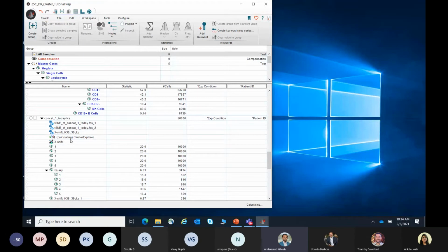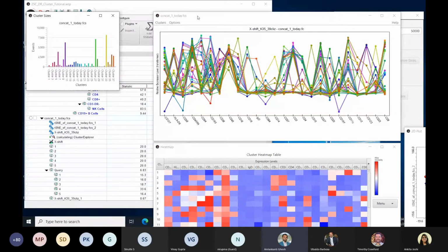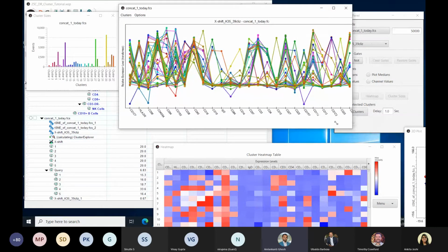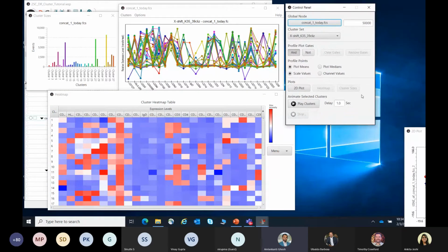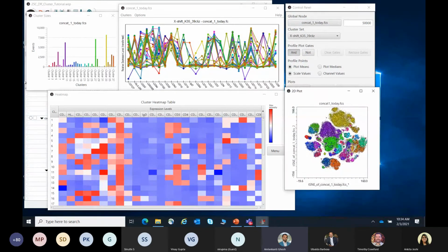Yes, there we are. Maybe the visuals are bad, it's taking time. Okay, it has come. What I can see here is I'll try to reduce it in order for you to see, and squeeze everything into the small space that I have. And this is the heat map. This is a control panel that also comes along. You can try different options here, it would be fun to try them. And this is the t-SNE space.